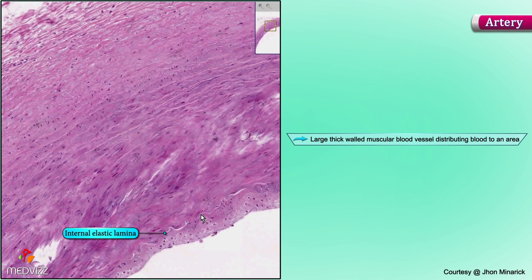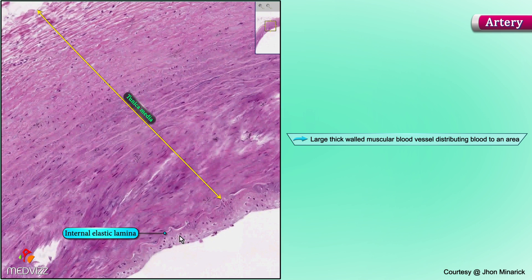Between the internal elastic lamina and the looser connective tissue of the adventitia is the media. Everything deep, or towards the lumen, from the internal elastic lamina is the intima.